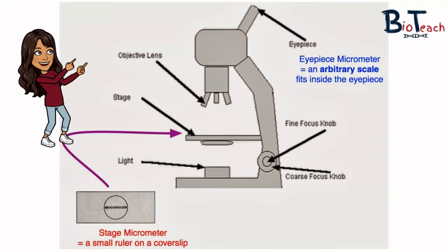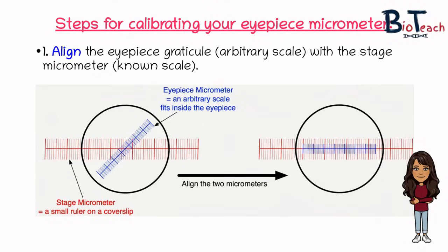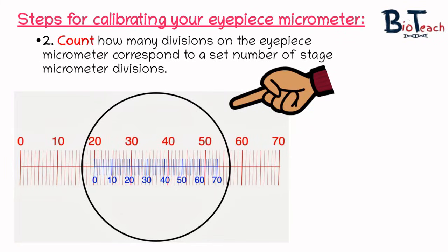This image shows the microscope with the eyepiece location and an example of the stage micrometer. There are various steps you have to complete to calibrate your eyepiece graticule. The first step is to align the eyepiece graticule with the stage micrometer. Once they're on top of each other, you need to count how many divisions on the eyepiece graticule correspond to a set of stage micrometer divisions. You could rotate the eyepiece a little to remind yourself which is which when looking down the microscope.